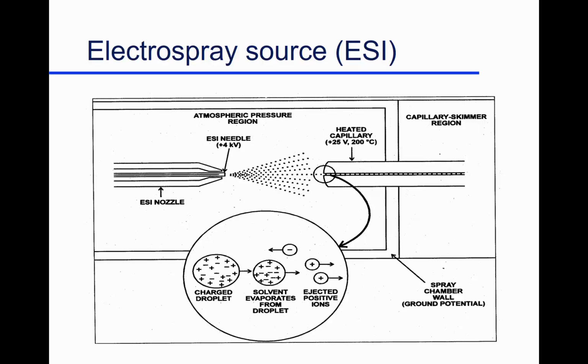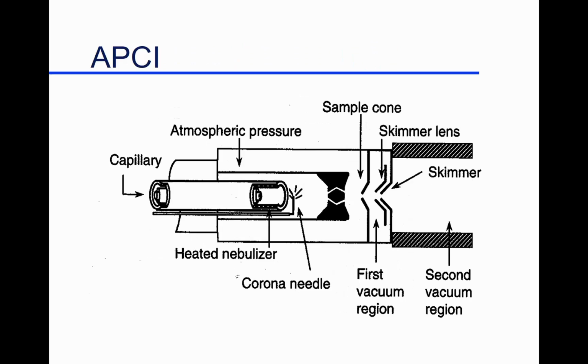And so basically you more or less evaporate your solvent off from the system, leaving the charge you put on your analytes, your molecules. So it's really a gentle technique. You don't see a lot of energy, a lot of things exploding into lots of pieces. But a nice technique, a very, very common technique.